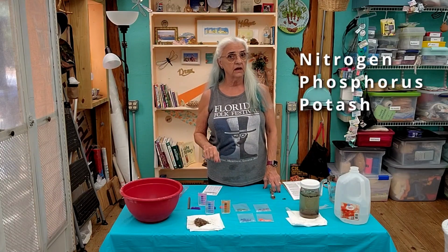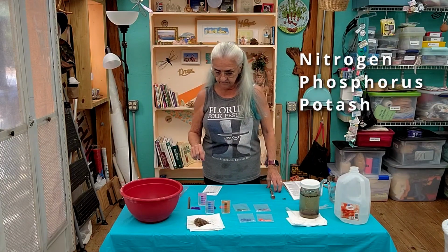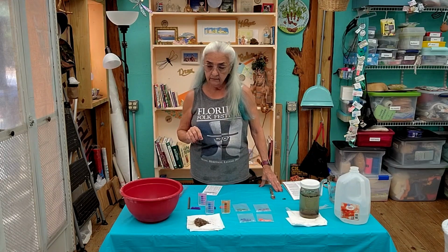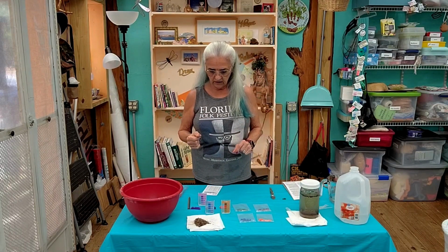So that tells me that my pH is probably somewhere around 6. Now I'm going to test the nitrogen, the phosphorus, and the potash. I'm going to assume that it might be very low if I've got any nutrients in there at all, but I'm going to test anyhow. I'll be doing the same thing for my raised bed where I have my asparagus, since it's much deeper. And after the winter comes and the asparagus dies back, I'll cut it back to the ground, and I'll be adding some nutrients then, depending on what those soil tests show me.